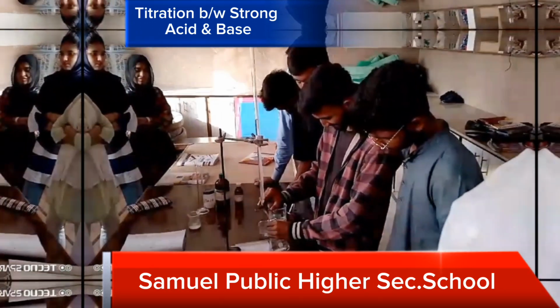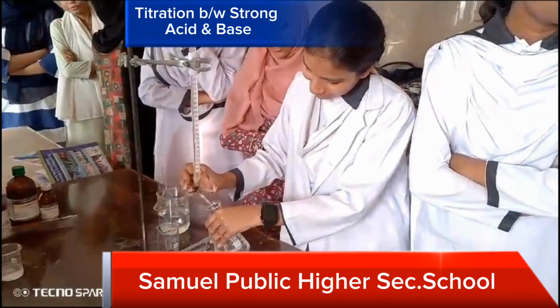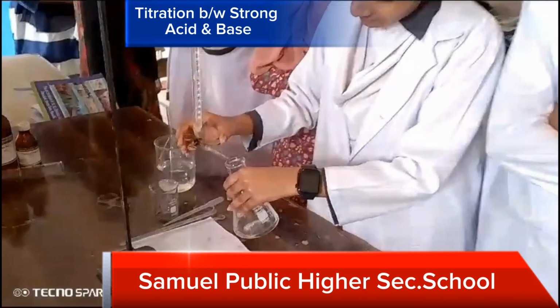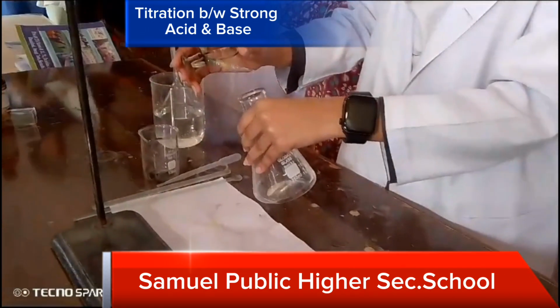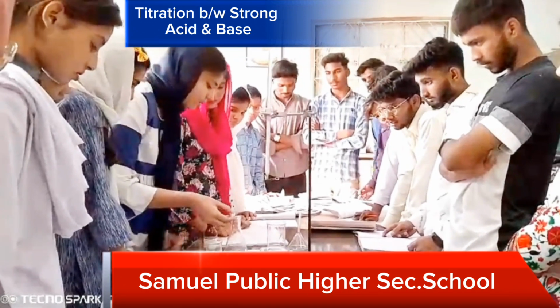After this procedure, add the sodium hydroxide to the conical flask dropwise and then shake.